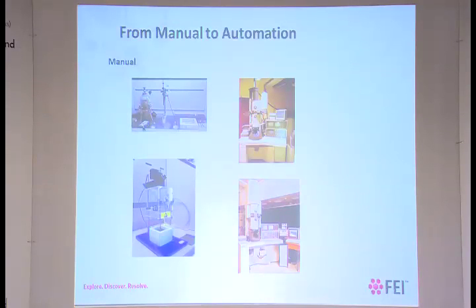which had limited software, so we couldn't manipulate the electron beam as flexibly as we can these days. But we would put our grid in here, and then we would have to search our grid, which was quite time consuming, set up our search parameters together with our exposure parameters, so we know we were taking a picture of the same thing we were seeing in low mag and then in high mag, set up our focusing procedures, and then shoot our image. So we were kind of shooting images quite blindly.